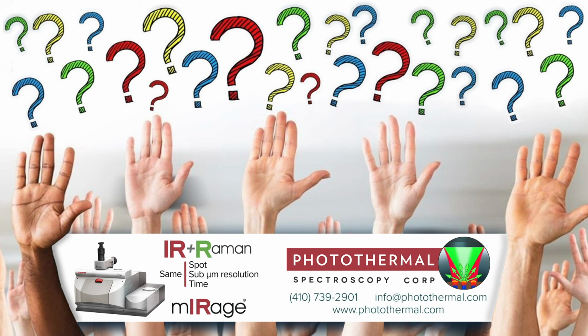Okay. I did say it was going to be the last one. We've had one more come in. Now this will be the last one. In fact, I think I'll take this one. How is it that O-PTIR does not suffer from Mie scattering, but FTIR does, and does Raman too?